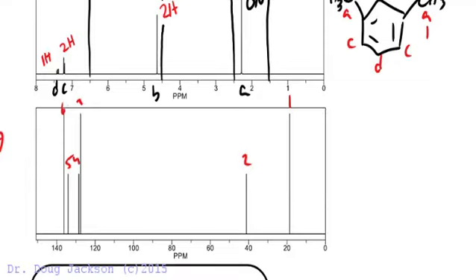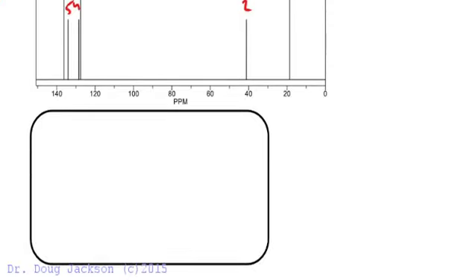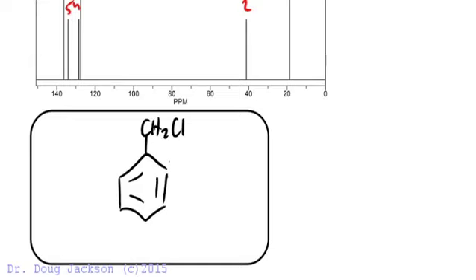So we have the symmetry, we have the solution to this problem as well. It's an aromatic compound, a highly deshielded CH2, symmetrical methyls, and 3 remaining aromatic protons.